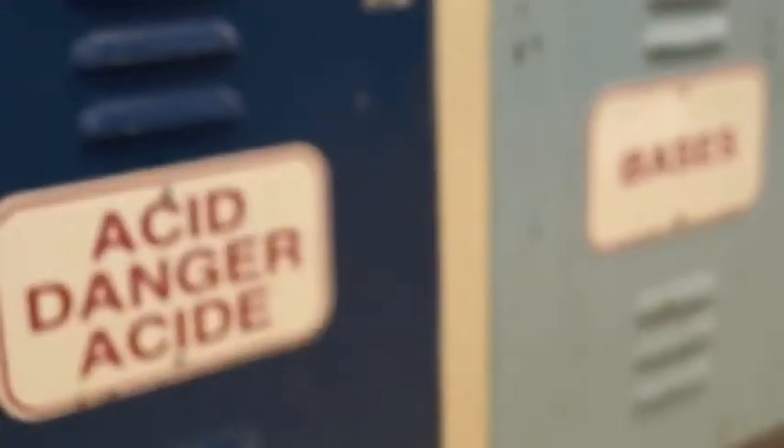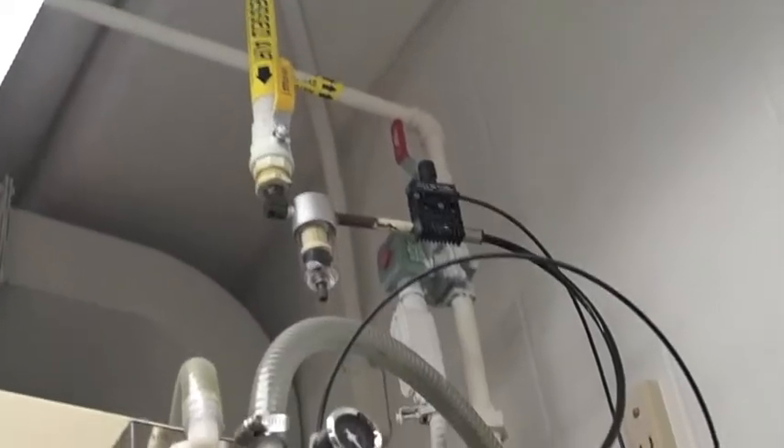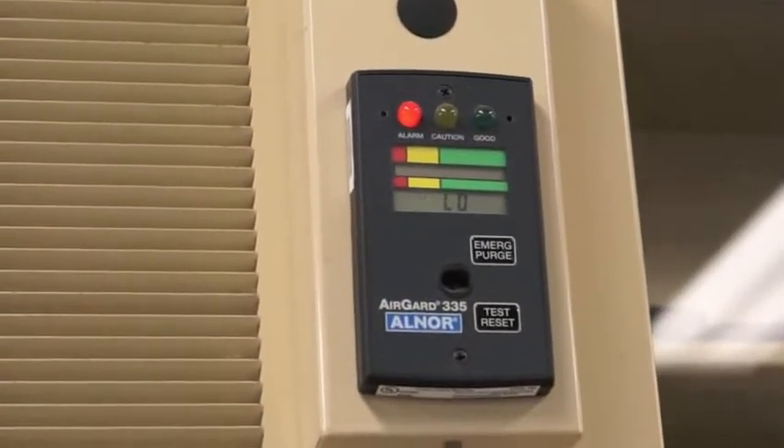A laboratory fume hood is a piece of equipment where harmful materials can be handled safely. Air flows into the hood and the fume hood captures and contains contaminants, preventing their escape into the laboratory.